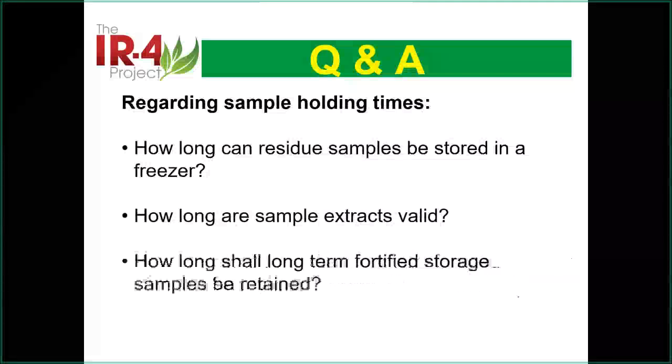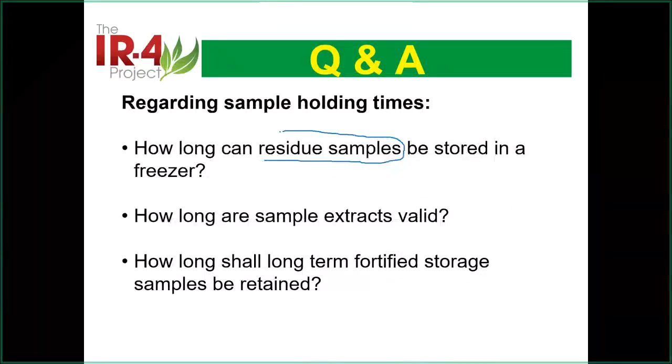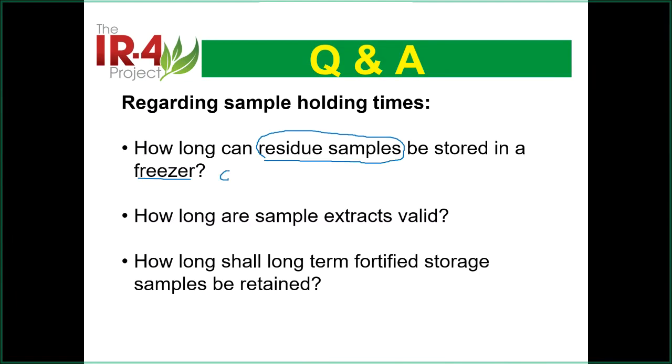Okay, we talk about holding time. For example, the first one we talk about is a residue sample from the field. How long should you keep it in your freezer? 6 months? 1 year? 2 years? Or 5 years?